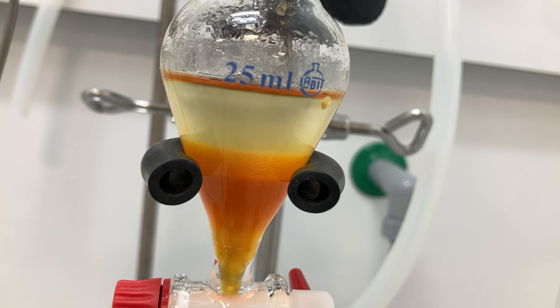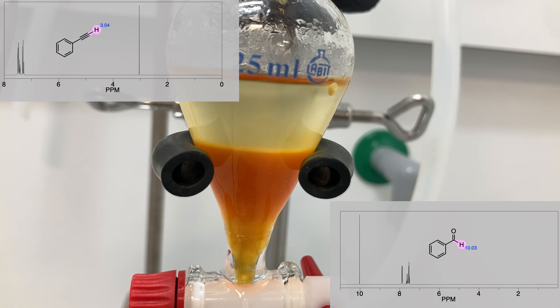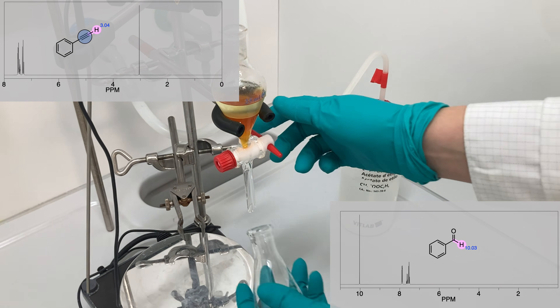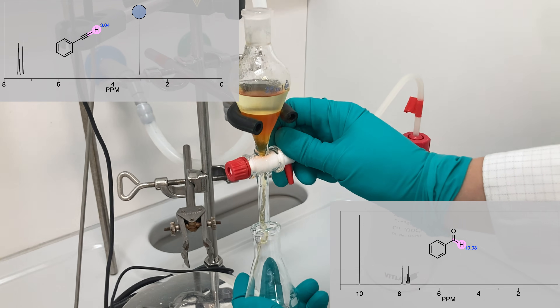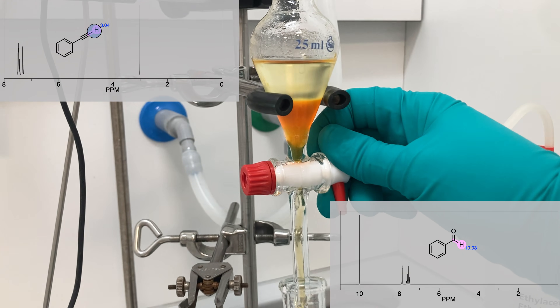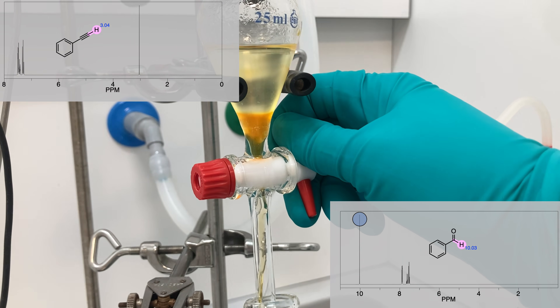After purifying the product, it was very easy to identify its structure using NMR spectroscopy. The NMR spectrum of the alkyne shows a characteristic peak at around 3 ppm corresponding to the proton of the terminal alkyne. On the other hand, the peak corresponding to the aldehyde proton, around 10 ppm, should not be present.